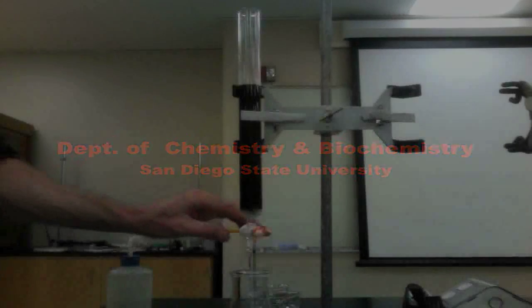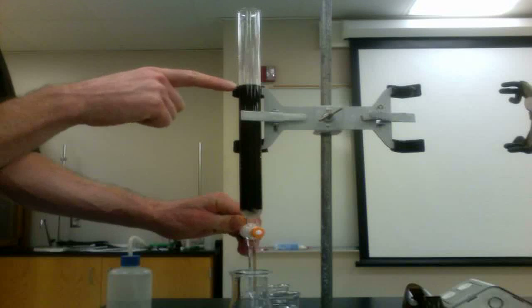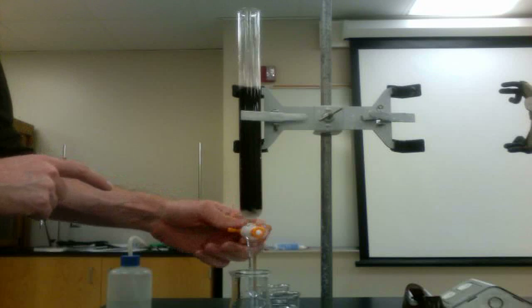In order to analyze the salt, we will perform an ion exchange to convert the salt into an acid. This will allow it to be titrated with the base.